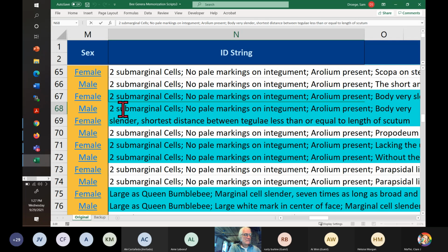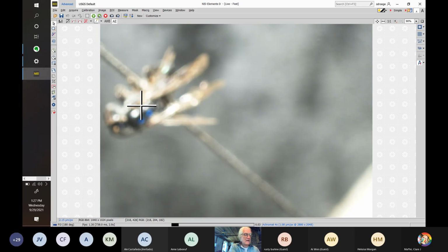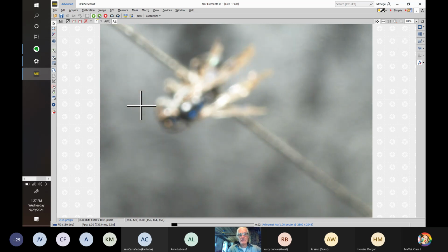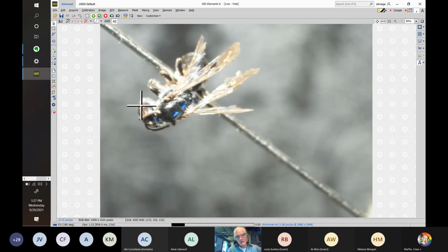And so let's see if we can visualize that here. And that's basically the ID string. Now that we're here, let's look at the female characters. And yeah, it's exactly the same. So if we go back now, let's see if we can note how skinny it is. It doesn't have what the others do, which is a very noticeable set of characters. It is a skinny, dark megachilid.